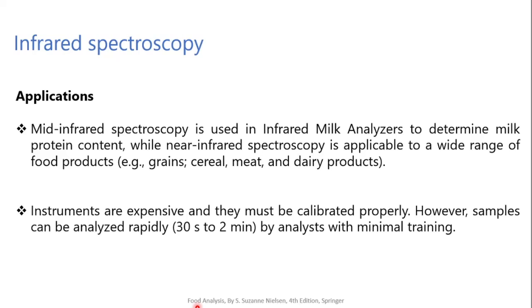Then this particular instrument is quite expensive and must be calibrated within the proper duration. However, the samples can be analyzed very rapidly. Around 30 seconds to 2 minutes are required for the analysis of one sample by the analyst with very little training. No such training is required for analyzing a sample.